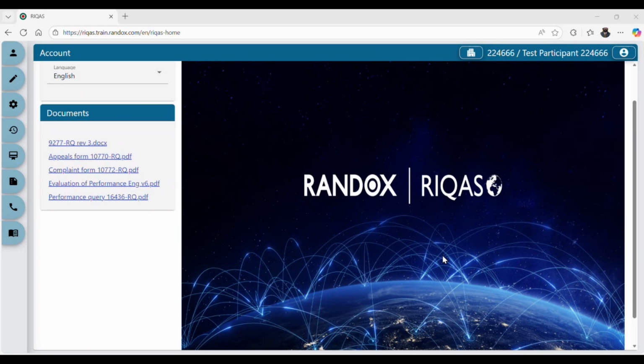The coordinator report will combine different lab sites data for the same test and show you your performance between different lab sites or different lab locations that perform the same exact test. In order to create the coordinator report, first of all, you need to have a user that has been assigned a coordinator role. So this will be a multi-lab director or the lab COO. Anyone who is given this role can then access this report.